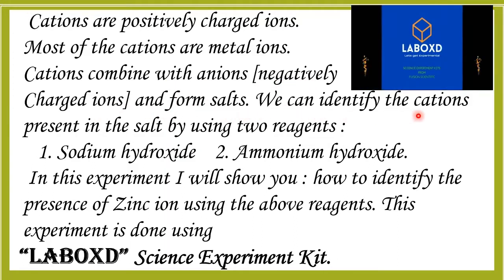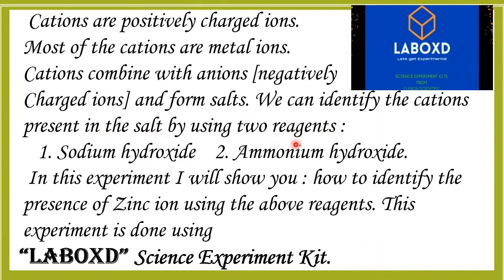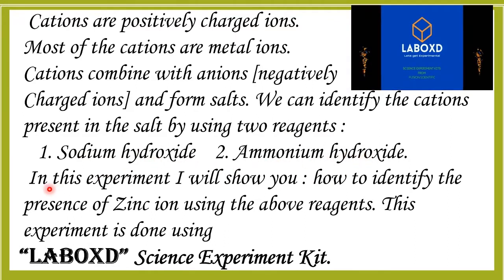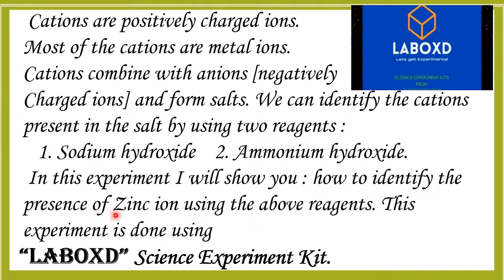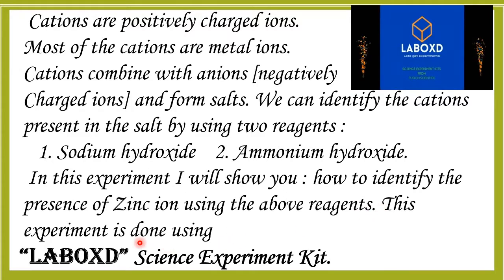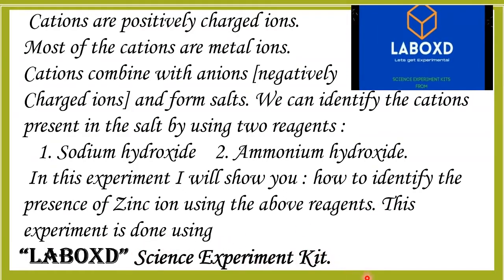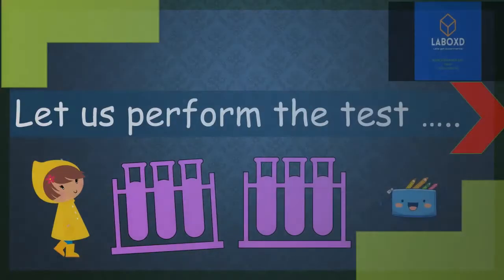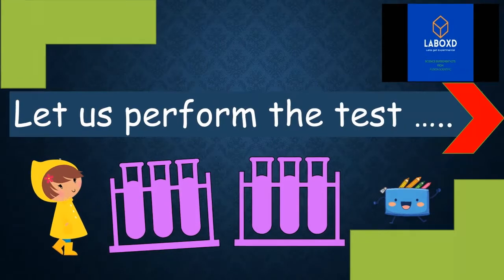We can identify the cations present in the salt by using two reagents, sodium hydroxide and ammonium hydroxide. In this experiment, I will show you how to identify the presence of zinc ion using the above reagents. This experiment is done using Laboxd Science Experiment Kit. Now, let us perform the test.